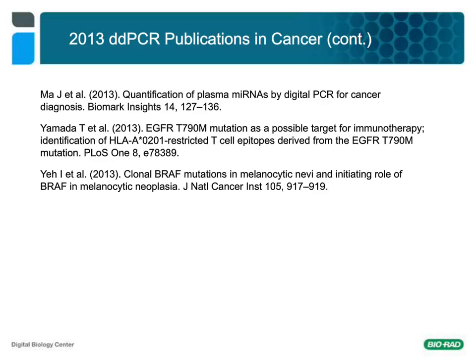So you can get much, much higher sensitivity, and the truth is, by that level, the main thing limiting you is generally the amount of sample you have. To do, for instance, plasma cell-free DNA to 1 in a million, in most cases you have to exsanguinate a person. So the first limiting factor is generally sample input, and the second limiting factor might be your assay design.